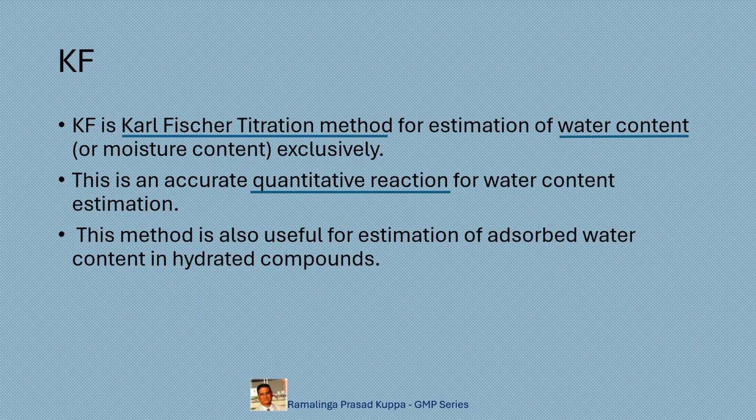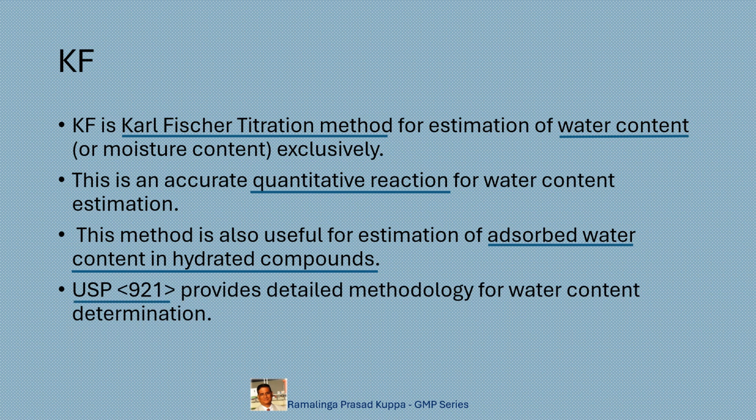This method is also useful for estimation of adsorbed water content in hydrated compounds. Water content in hydrates can also be estimated accurately with this method. USP 921 provides detailed methodology for water content determination. So, more detailed information on the titration method is available in this chapter, USP 921.